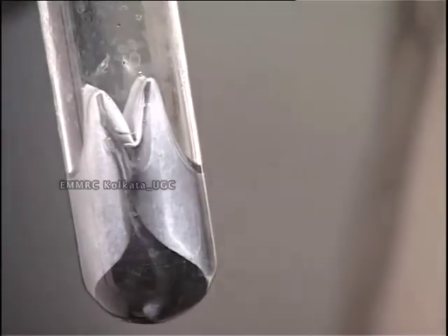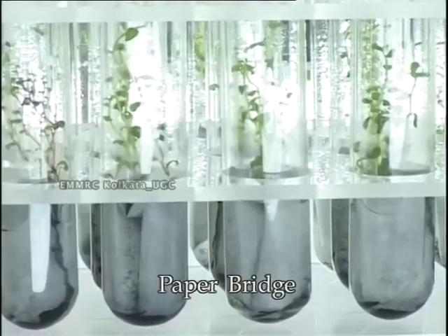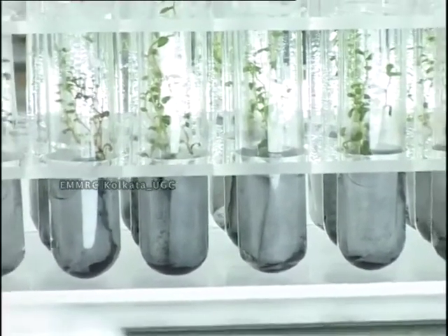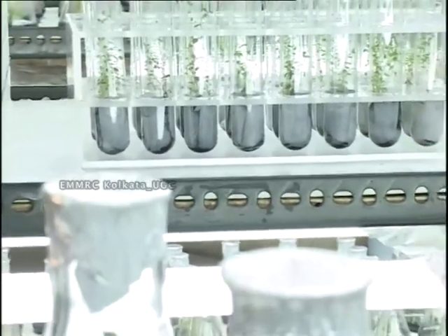This M-shaped paper is called a paper bridge. On the top of the paper, the plant is grown. This prevents the plant from suffocation.